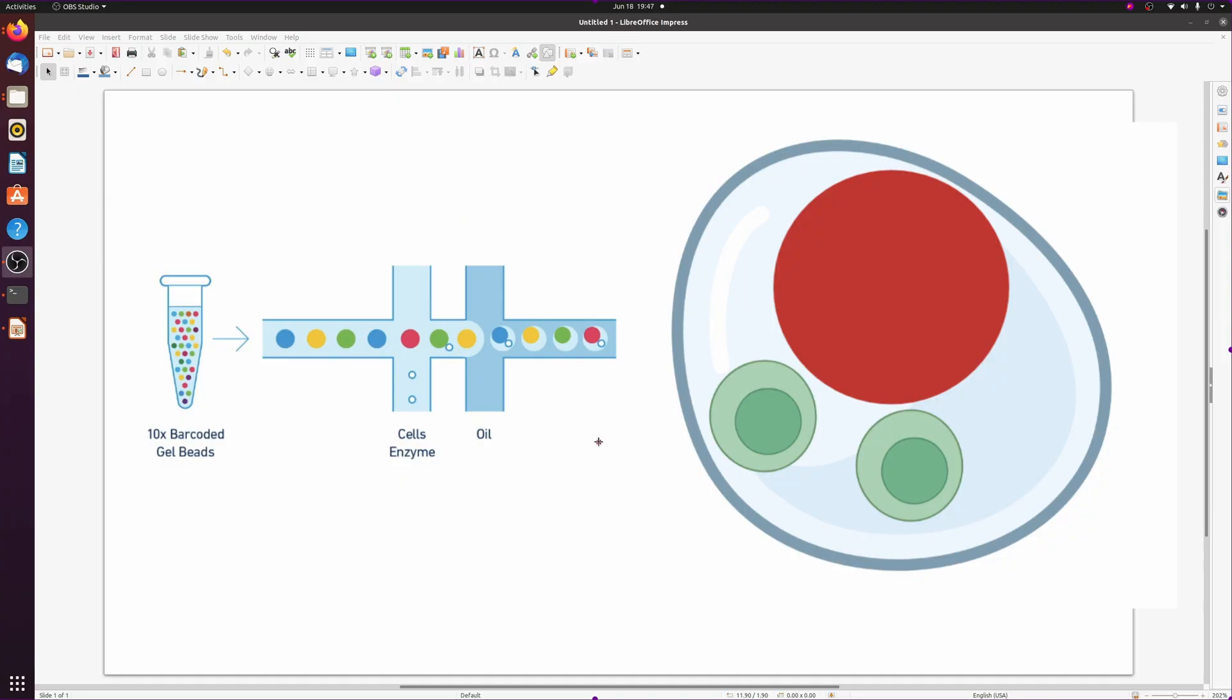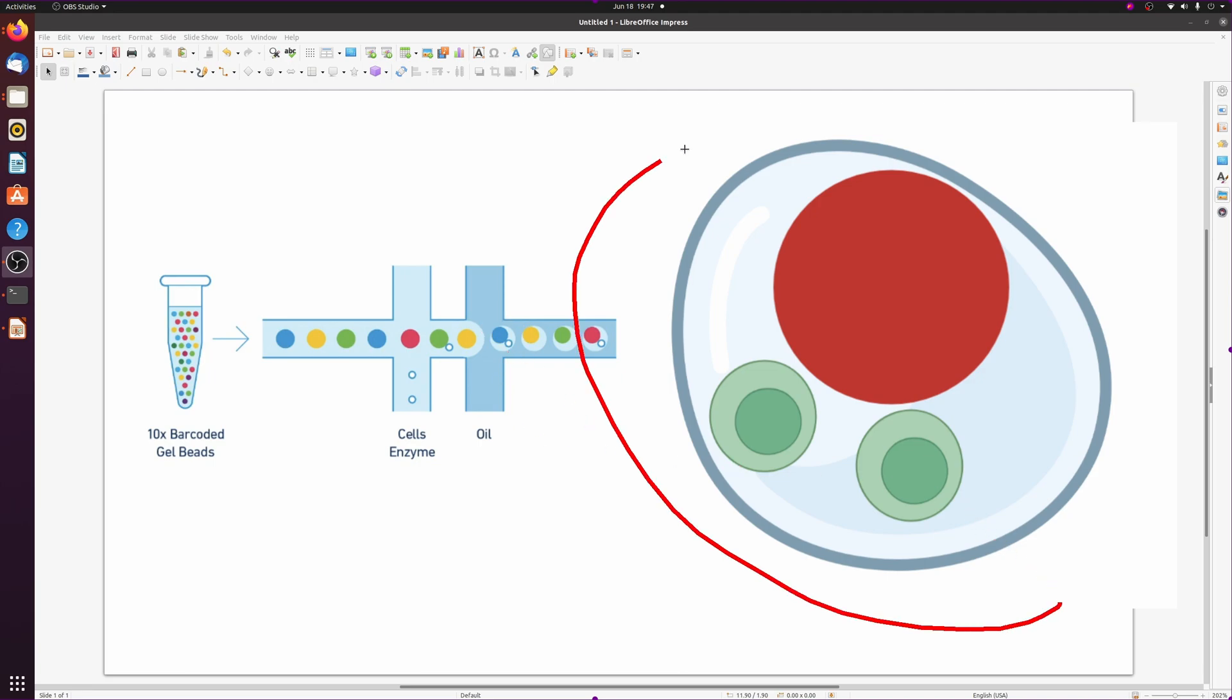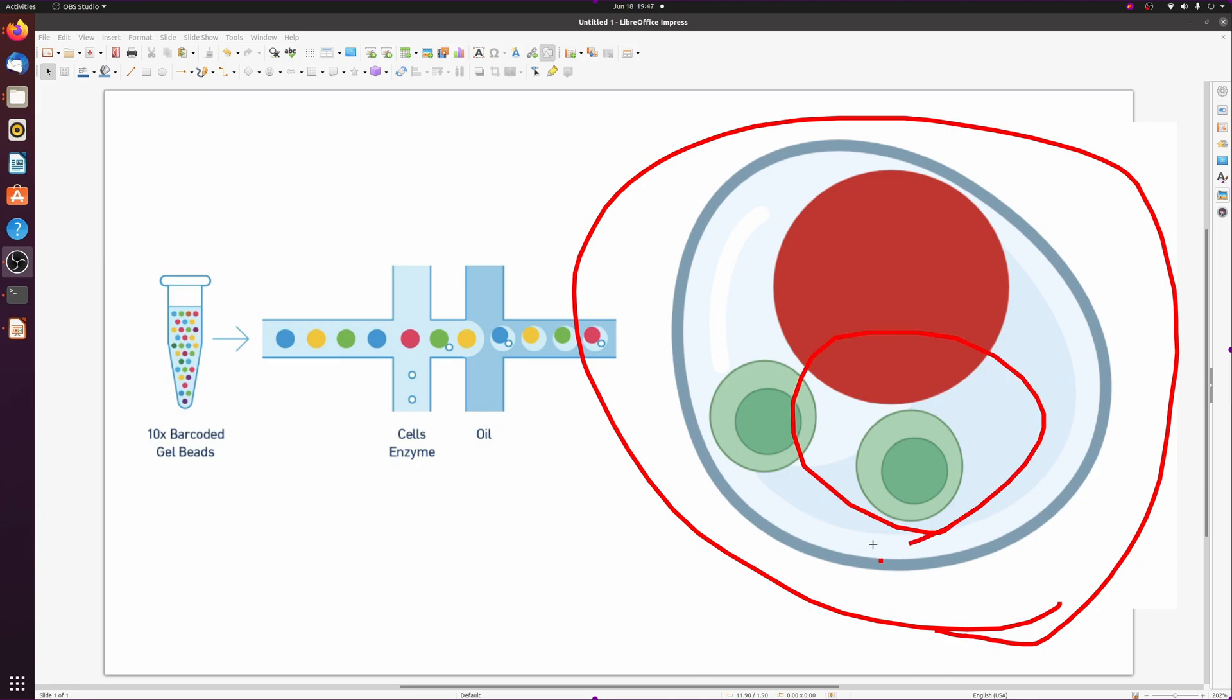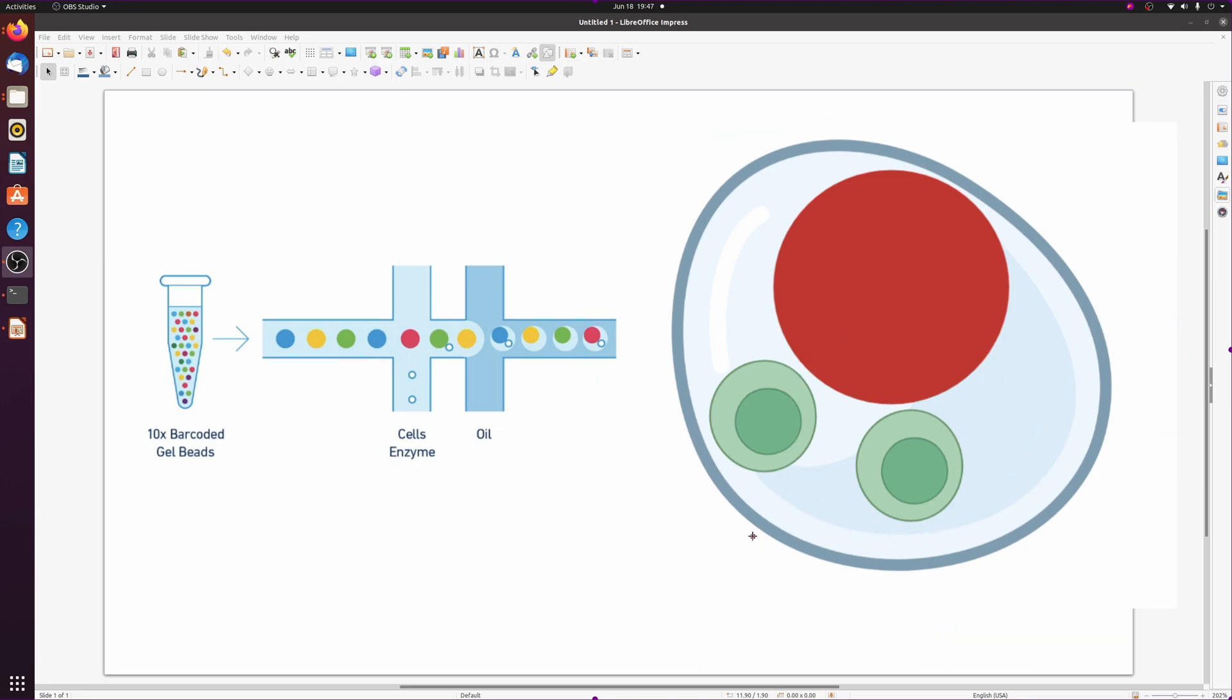When you're doing single cell sequencing you have a chance for doublets. For example, in the 10x workflow you're just squirting enzymes and beads and cells through a tube and hoping that they come out in these nice little single partitions. But in actuality you get droplets like this that actually has two or more cells.